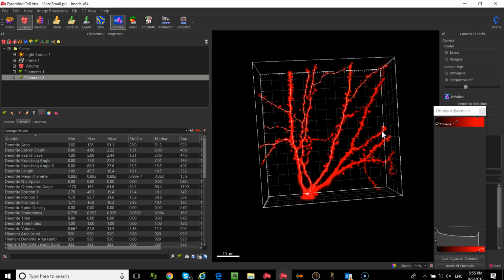It's not for multiple neurons in an organ. It would be for a branched epithelial organ. Oh. So like the lung or the pancreas or something like that. Awesome. Okay. So typically for that kind of thing, I would use the other technique. We have another technique called threshold. I don't think I'll have time to go over it.